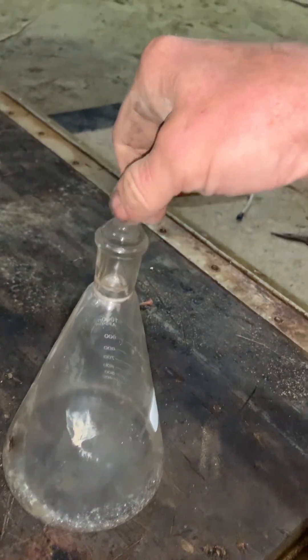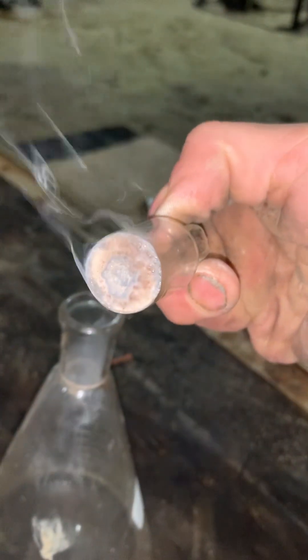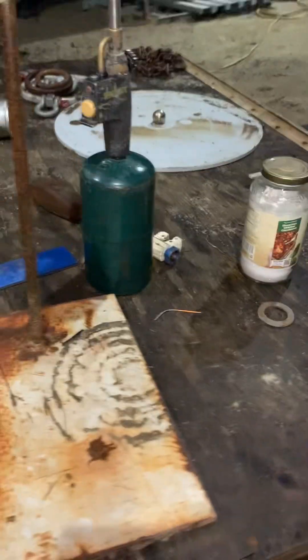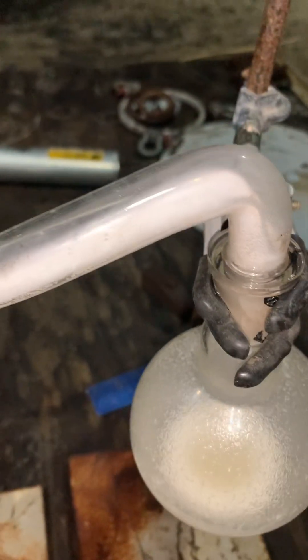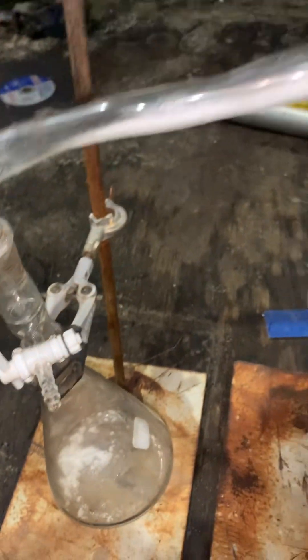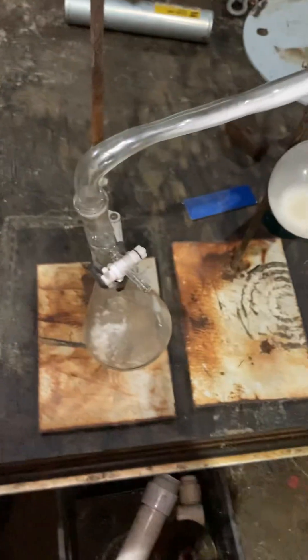As you can see, when you take the little stopcock off — same goes for this, I'm sure. As you can see, I started getting some white precipitate that started to come over. And I don't know what that is, but that's why I stopped the reaction. I don't know that much about this reaction, so if anyone else wants to give it a go, maybe post their findings — that'd be cool.